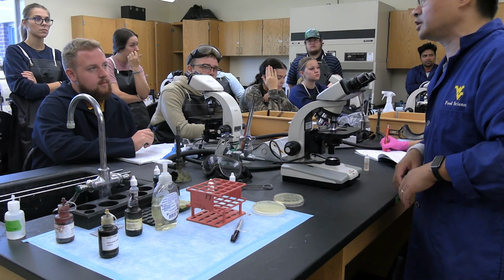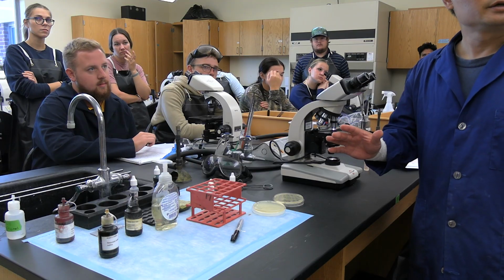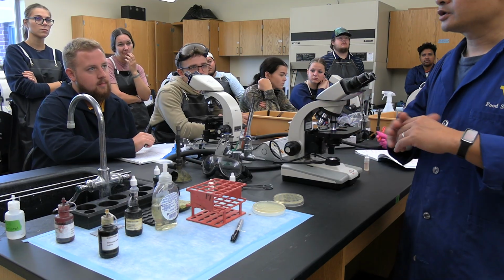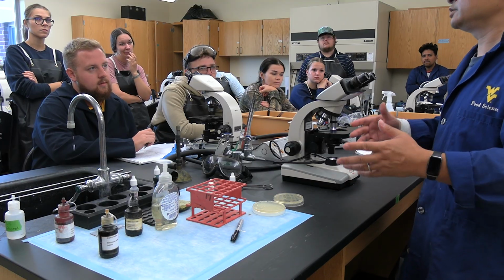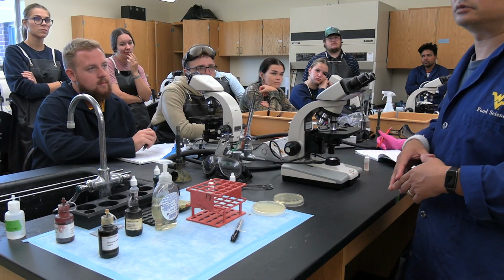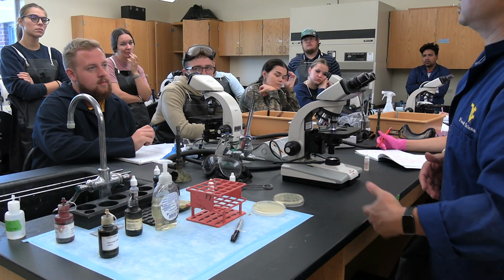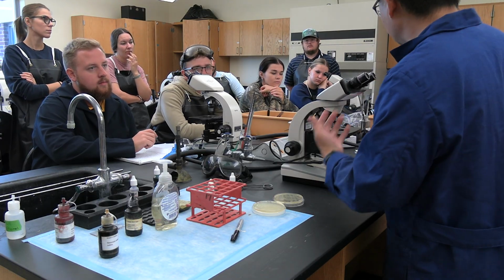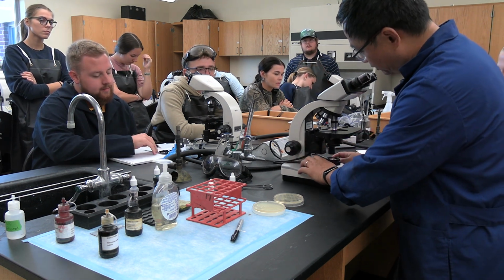Then you can take a picture again. You can write in your notebook what the results look like. If you see a very pure gram positive culture, then you can say, well, that's really good. But if you see a mixed culture, you can discuss that the reason may be cross-contamination. That we'll talk about later on. So what kind of thing do we call cross-contamination? Okay, very good. So we are finished here.